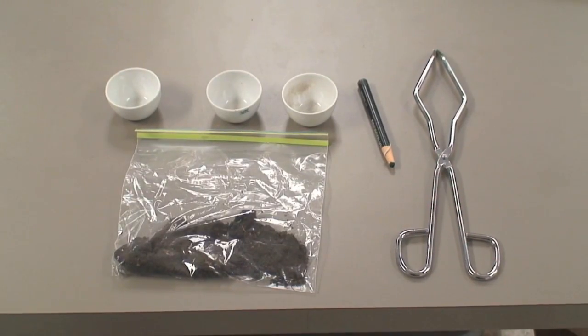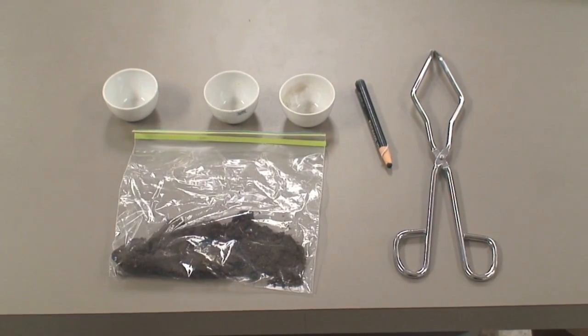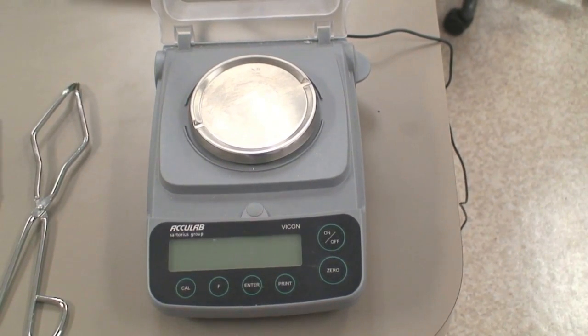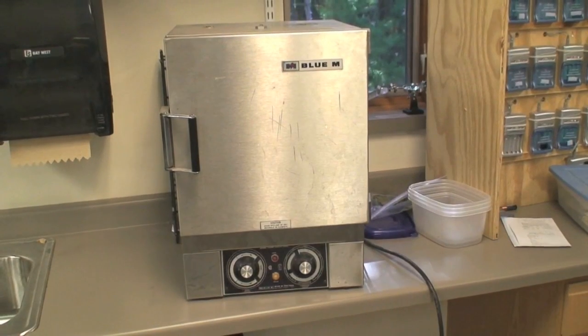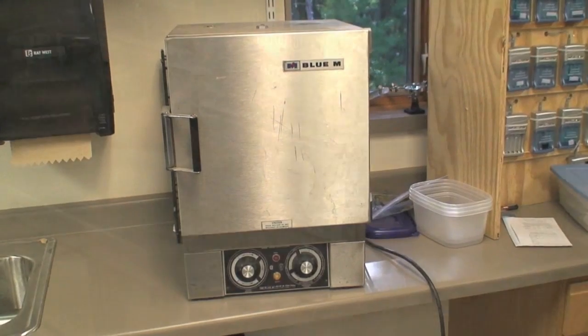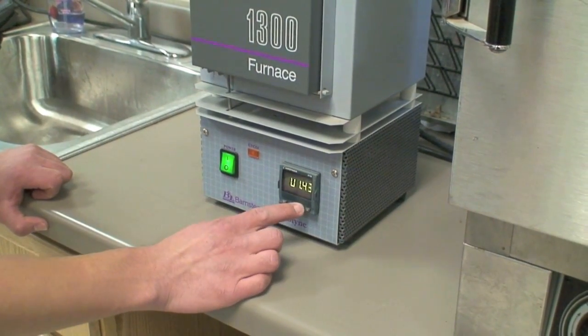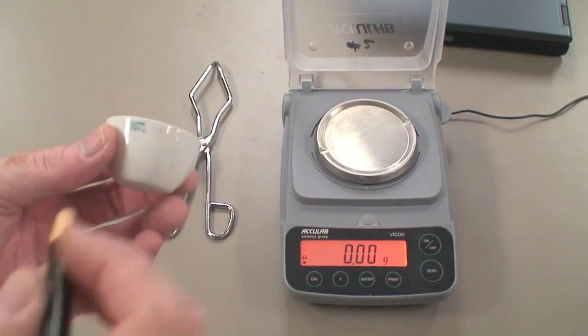For these tests, you are going to need your soil sample, crucibles, a way of numbering the crucibles, tongs, a scale, a drying oven or a regular kitchen oven, and a muffle furnace or Bunsen burner. You will also need a calculator, hot pads, and a way of recording results.